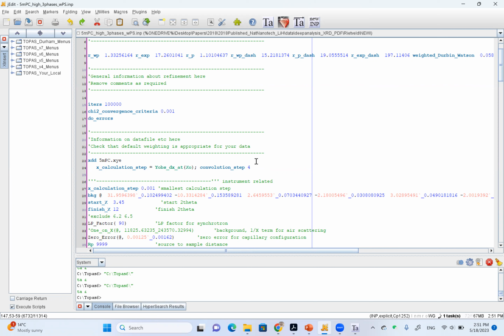So when you see it necessary, you can introduce the Stephens profile function into the lithium hydroxide structure in the refinement. You can first make all the parameters zero in the Stephens profile function. So it requires 5 parameters. You can put them all zero and just let it run and see how it goes. Okay.